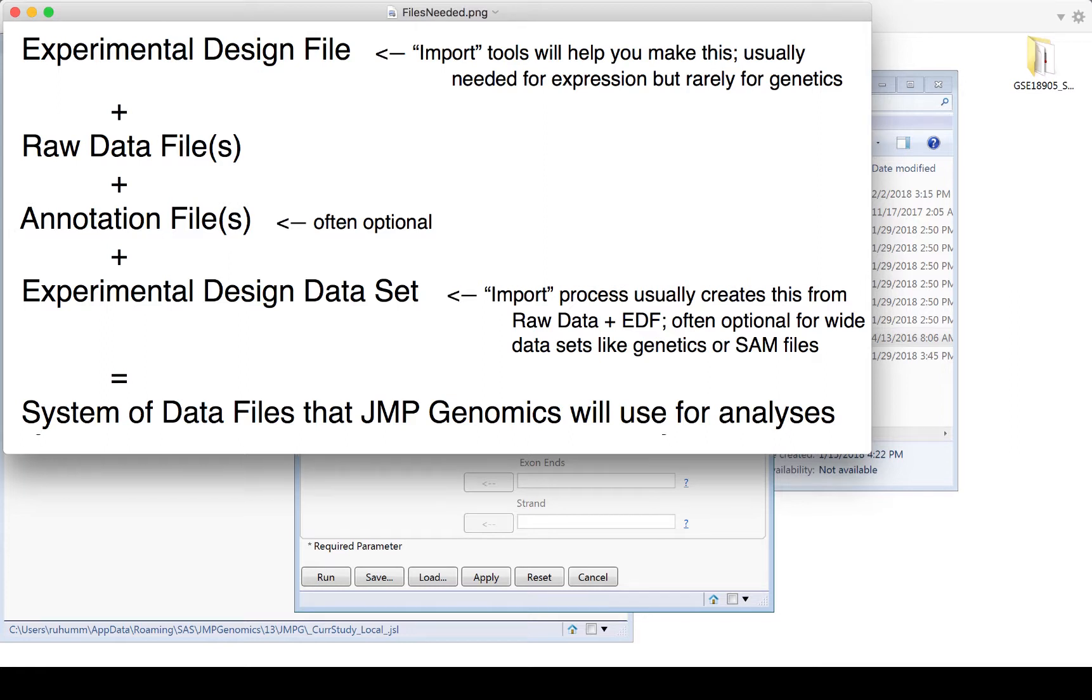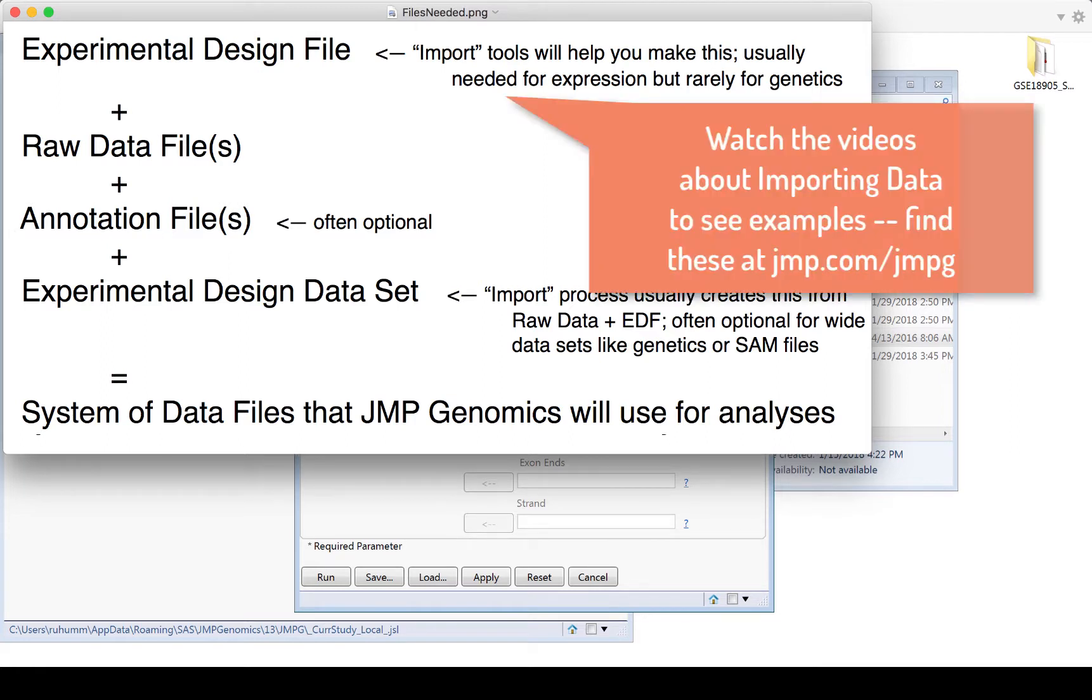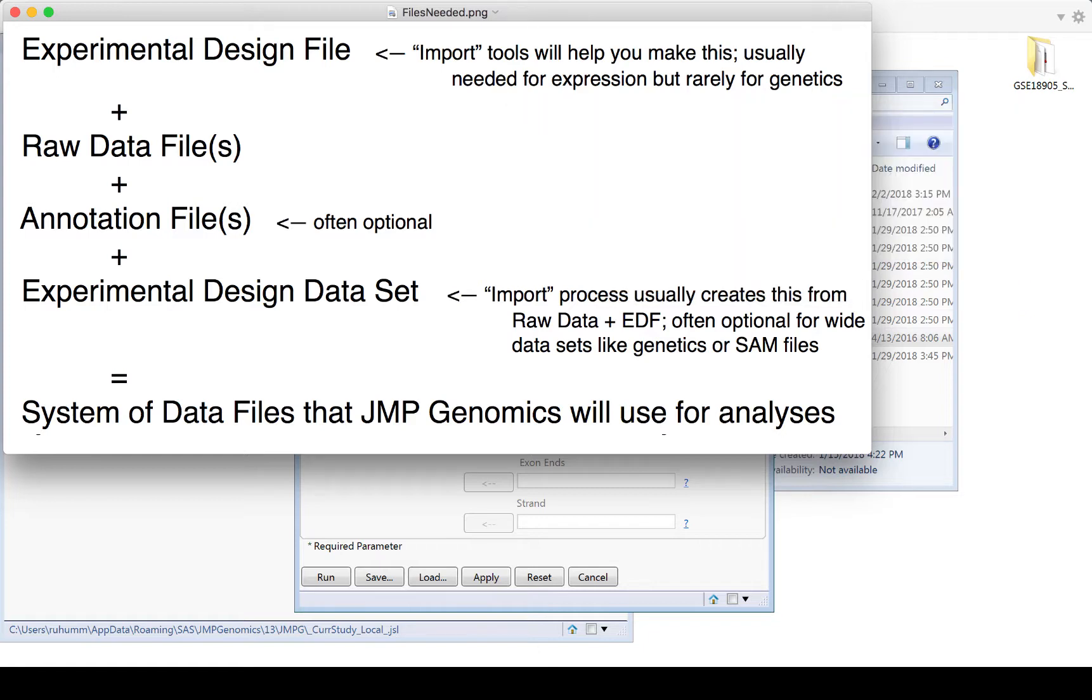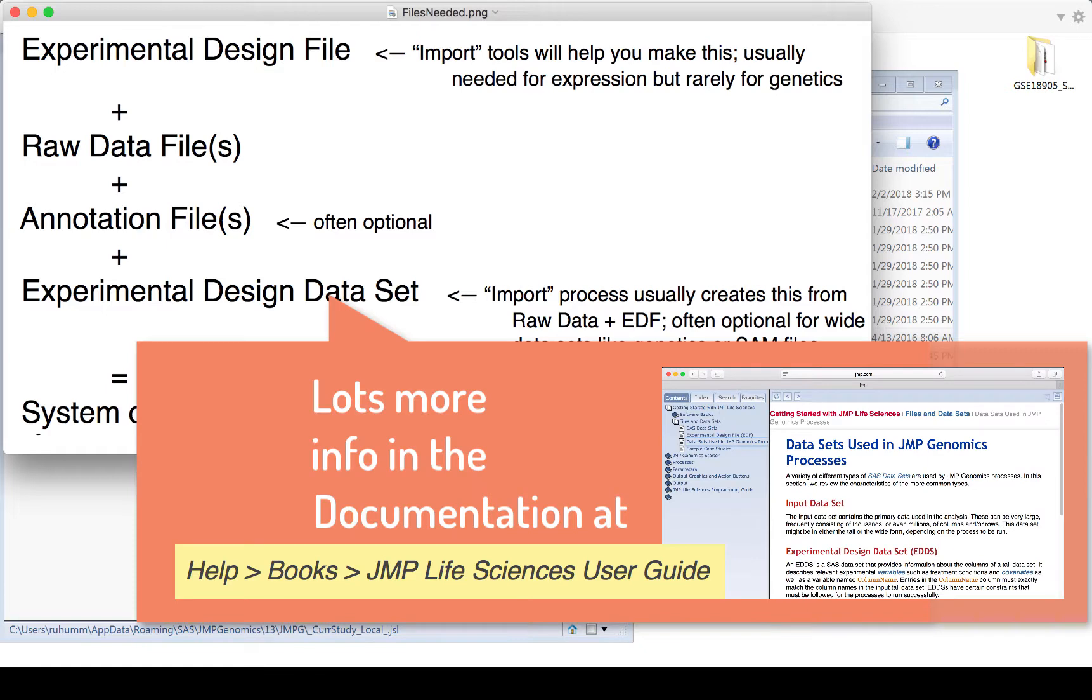You'll need your raw data files, sometimes you'll need an annotation file, and very often you'll need an experimental design data set, which again is sort of created through the import process in many cases. And then all those things together are going to create a system of data files that are referencing each other that JMP Genomics is going to use in the other analyses.